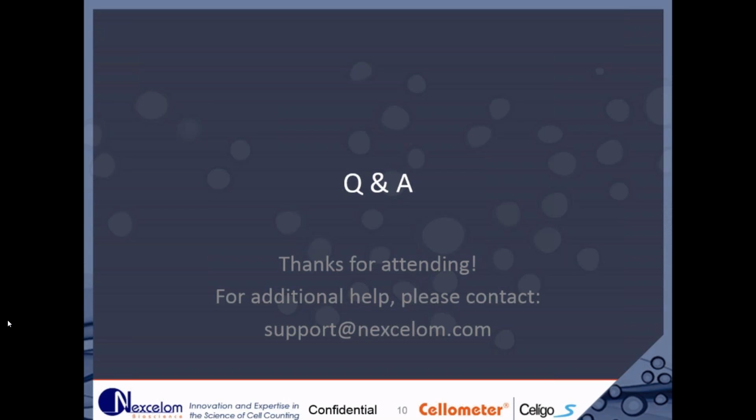Great. So our next question is kind of a mouthful. It's got a couple questions in one, so let me know if you need me to repeat any questions that I read out to you, Sarah. It starts off with, what is the advantage of acquiring the bright field image in this experiment? Can the procedure be performed on non-live cells, for example, with fixed, permeabilized cells? And how can you improve the cell object detection when the cells are not spherical and are more flattened or have complex structures like overlapping dendrites?